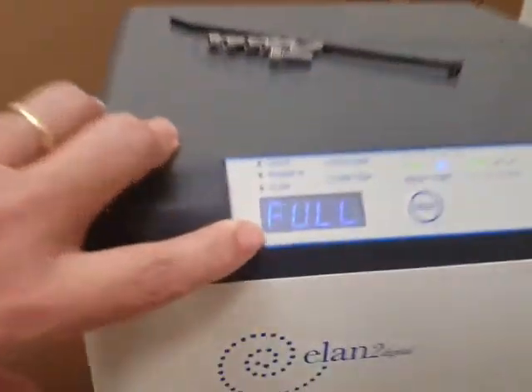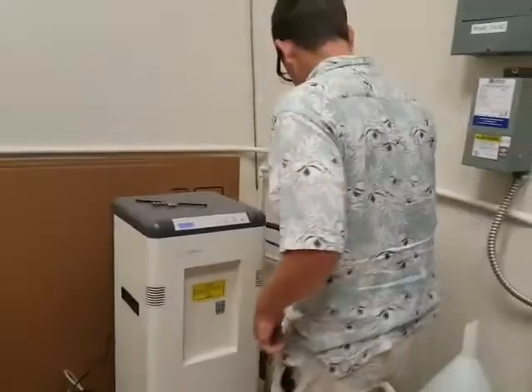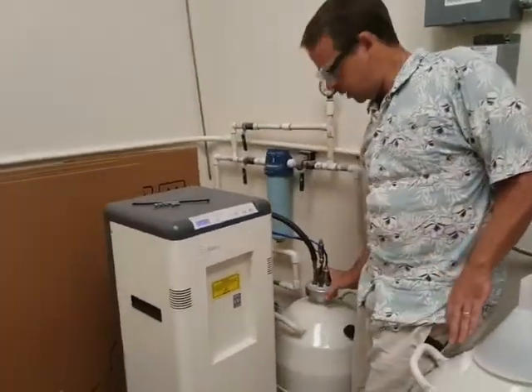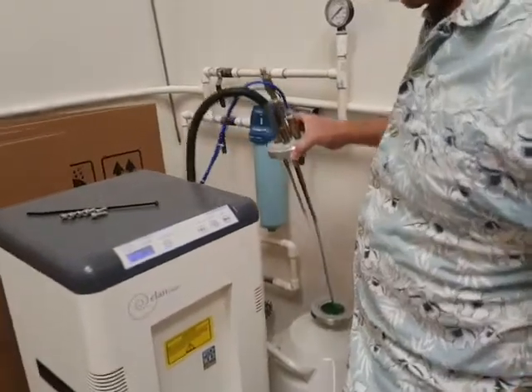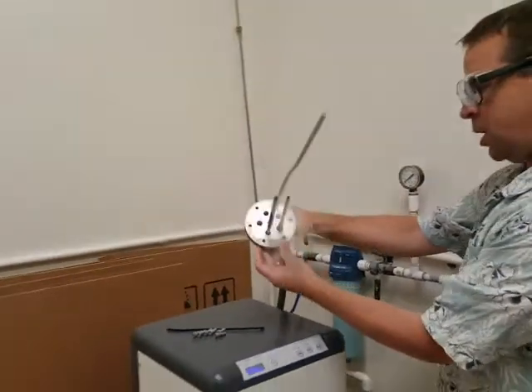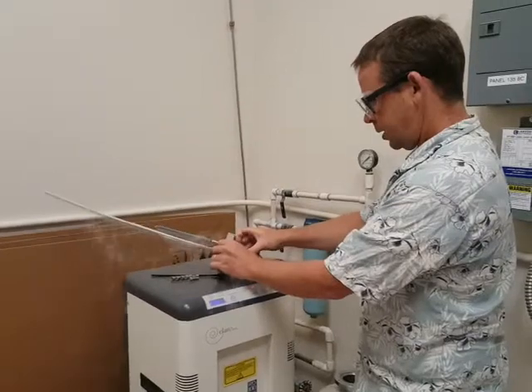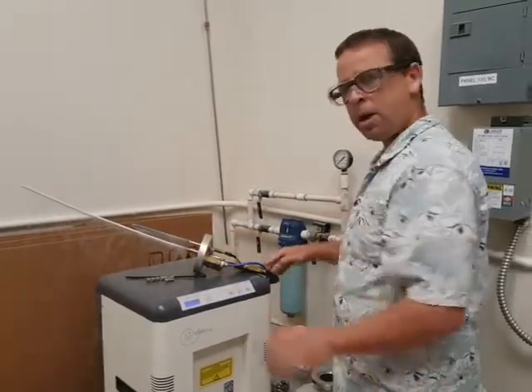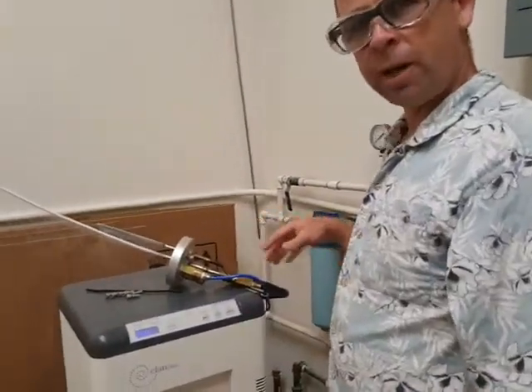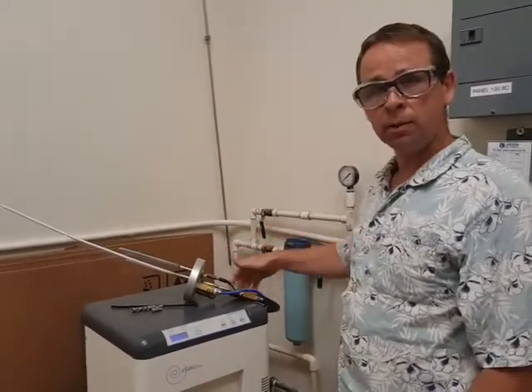Usually it'll be making a significant amount of noise. What we do here is we just lift this completely out and place it on top here. I want to make sure that everybody recognizes that these tubes right here can't be broken, so we've got to be very careful about them. If it has transferred recently and this is still pulled, it will be too firm, and if you try to move it like that it'll break one of the hoses here.